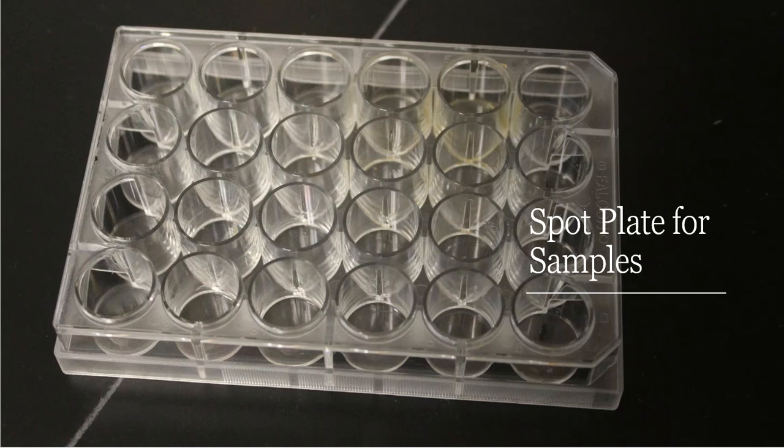Instead of having multiple weigh boats, instead of having multiple things that I'm going to have to juggle, why not just pick one, like a spot plate, and do all my sample prep here where it's organized and convenient and very easily accessible to me.